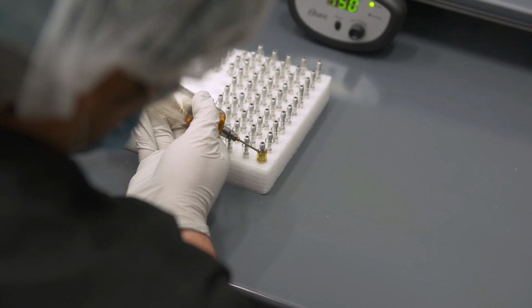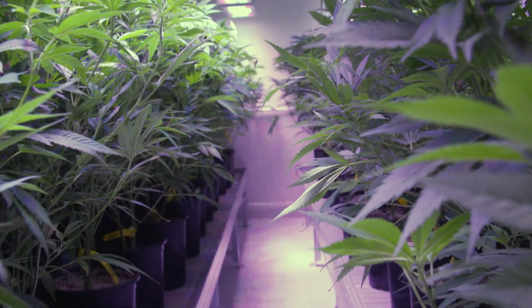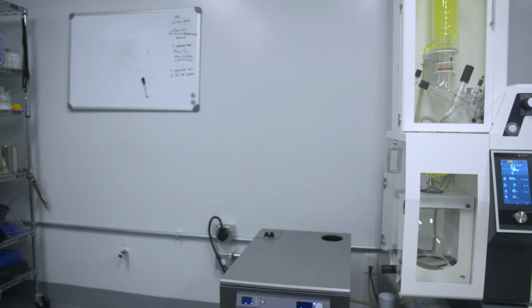to understand the chemical makeup of that oil and to be able to formulate that oil in the proper dose to give the desirable flavor or fragrance in the product. So this can be directly applied to the cannabis industry by being able to understand the proper method to do the extraction, proper method to analyze the oil that then gets used in a cannabis-containing product.